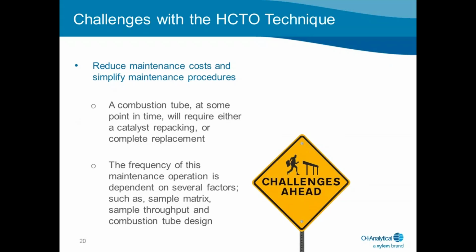So we see that there are challenges with the combustion TOC technique. And these are not found in other techniques by virtue of the fact that a combustion tube operating at high temperature is employed in the analysis. At some point, maintenance action of some form must be carried out on the combustion tube. This is generally confined to replacement of the catalyst.